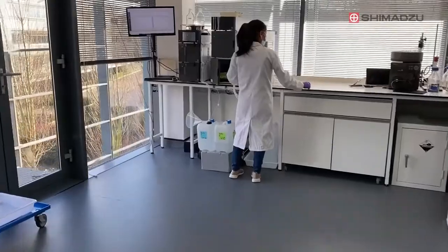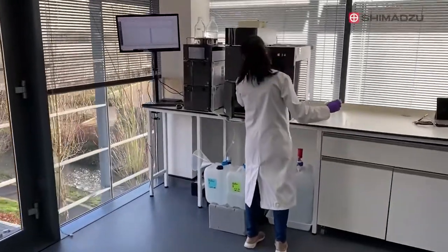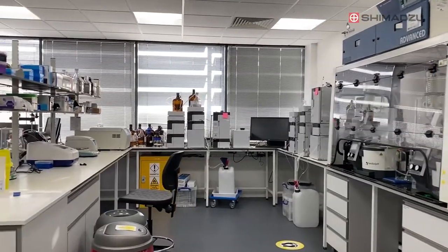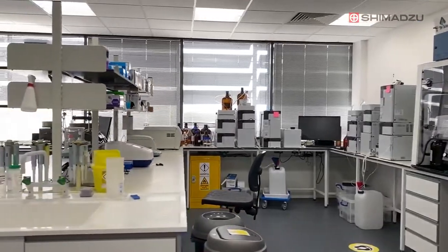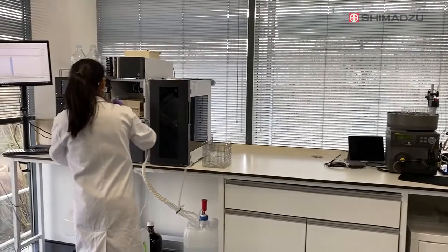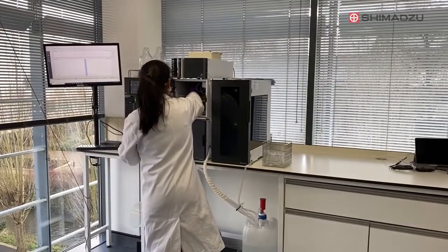Recently, we've been supplying certain sequences on the scale of tens of grams, so that's about a 10,000-fold increase in scale. So obviously achieving that has been a really major technical and logistical challenge. We've had to repurpose our research and development site in Oxford as a production line, and we've needed new equipment, new staff, and completely new procedures.